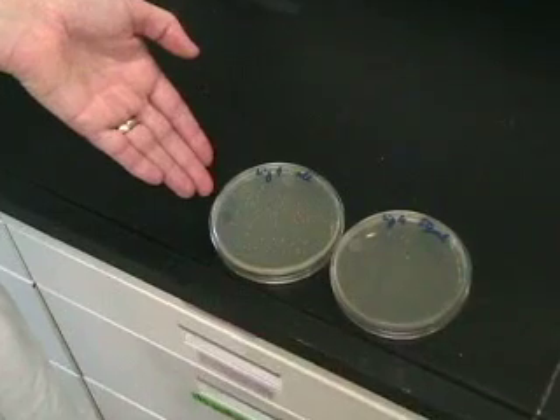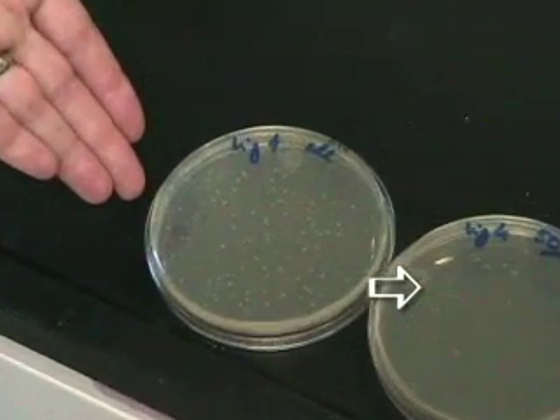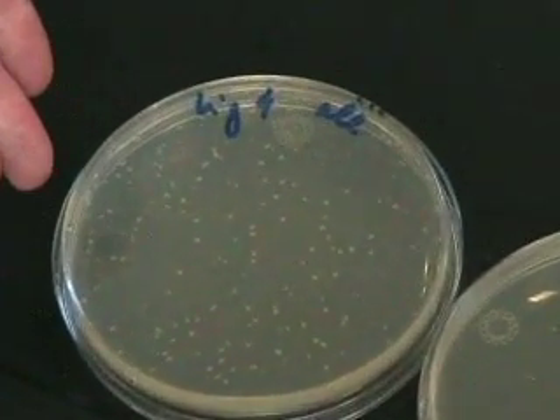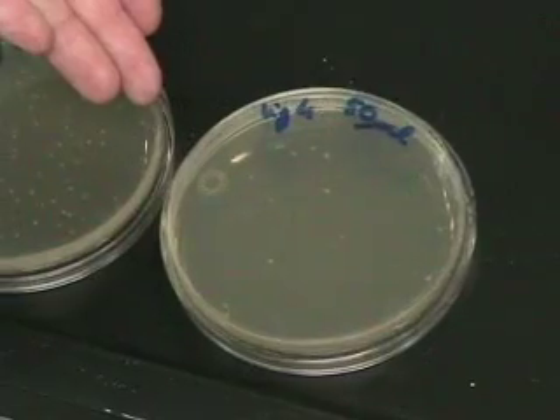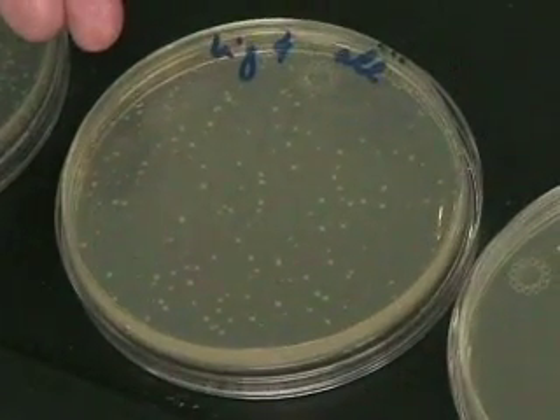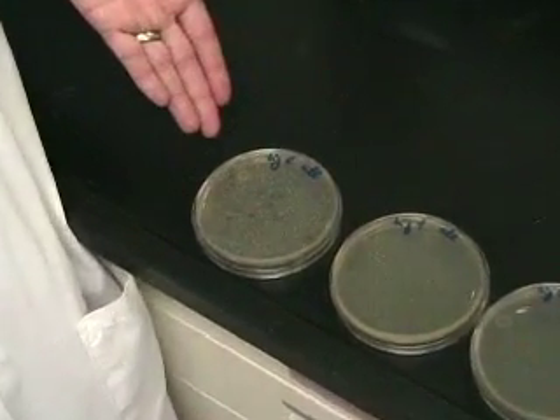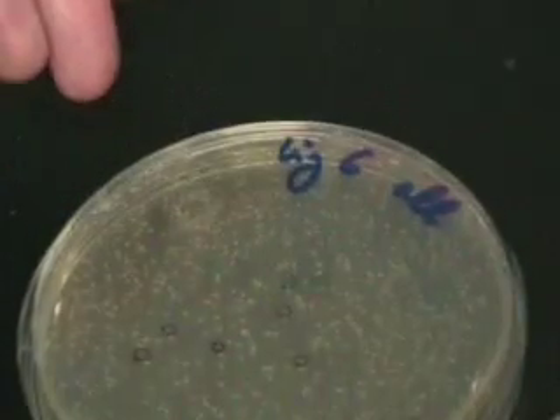After 12 hours of incubation at 37 degrees, we get the plates out of the incubator. As we can see, we have fewer colonies on the plate where I plated 50 microliters than on the plate where I plated the rest. What is important when you transform bacteria is to have the right amount of colonies — the right density. This plate has very few colonies. A good example is this plate, where it's exactly the right density, approximately 100 colonies per plate. This plate is a bad example because there are too many colonies and you cannot pick individual colonies.